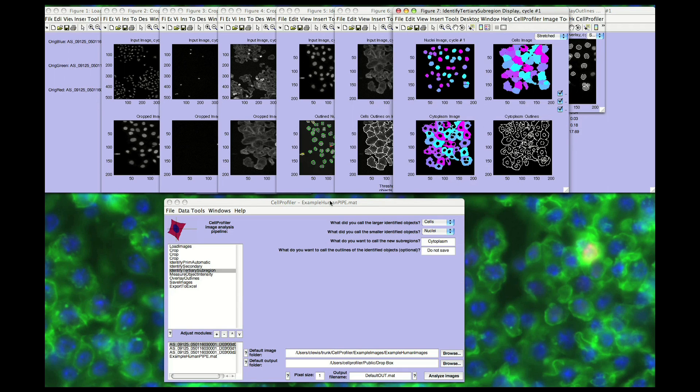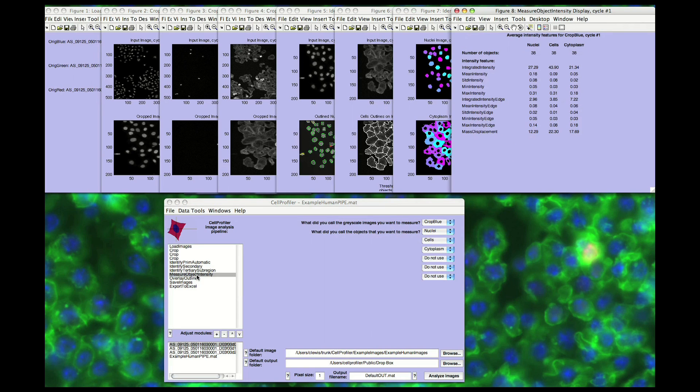Now, in this pipeline, we're using these objects as inputs for the measurement modules. Cell Profiler measures a large number of features for not just an image in its entirety, but also for each identified cell or subcellular compartment, including area, shape, intensity, and texture.